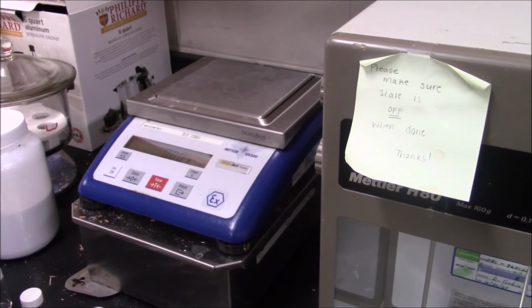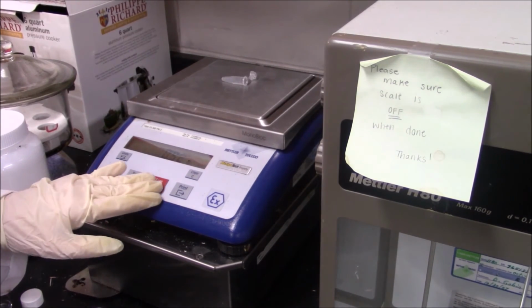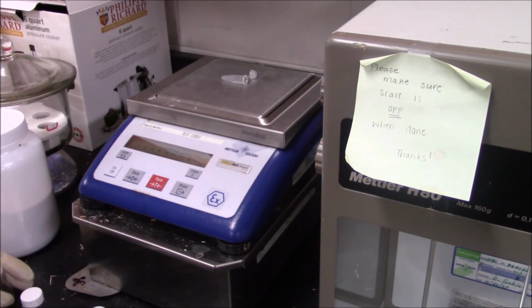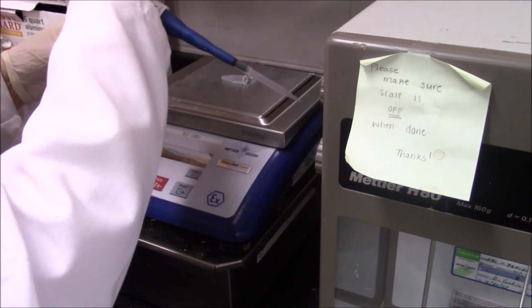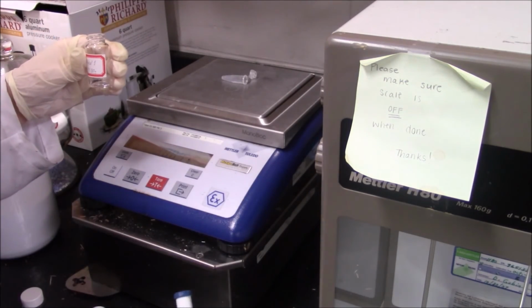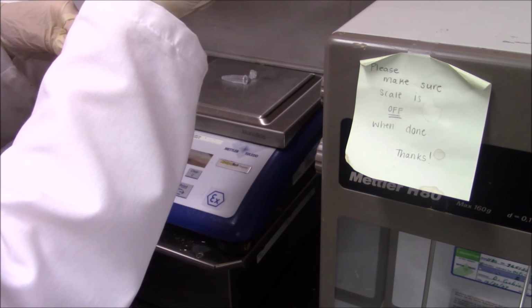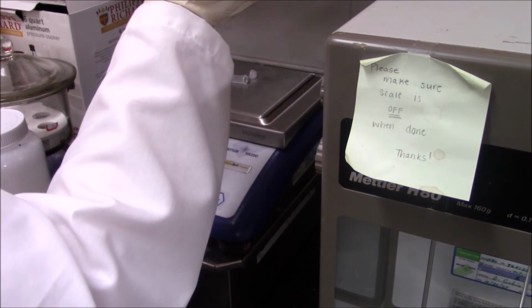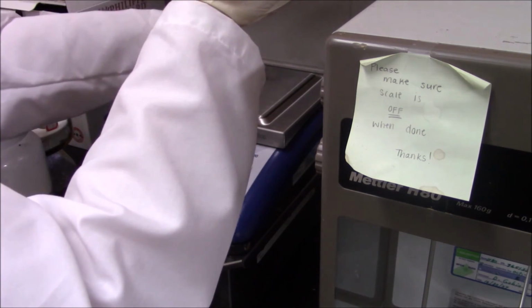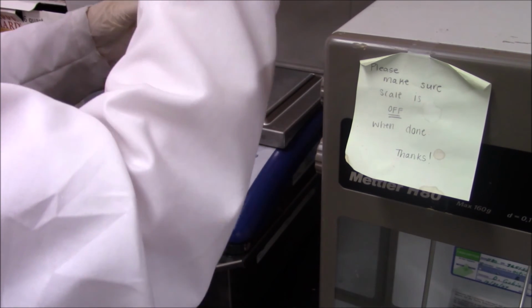Complete the charts and calculation of ethanol yield. This is done by first weighing the full vials and determining the mass of the liquid by subtracting the empty vial mass from the full vial mass. Then, take 1 milliliter samples from each flask using a 100 to 1000 microliter pipette. Place the samples into plastic centrifuge tubes and weigh them using the scale. Remember to weigh the empty centrifuge tube first and then zero the scale so as not to include the mass of the container in your calculations.